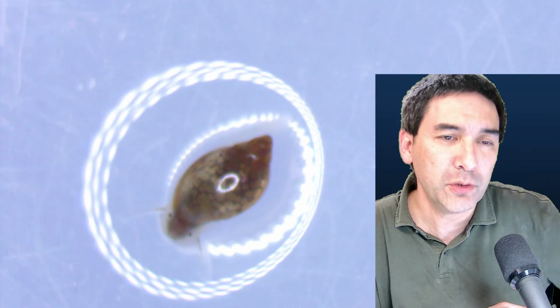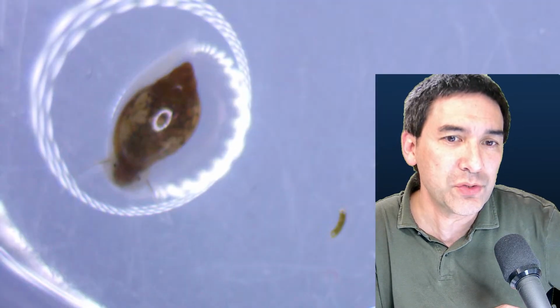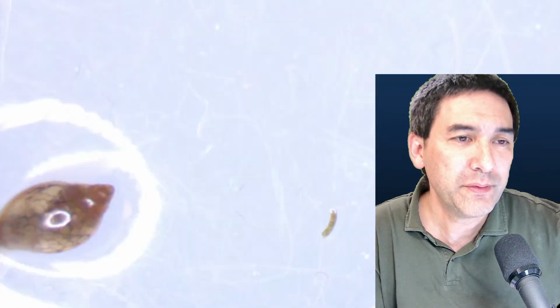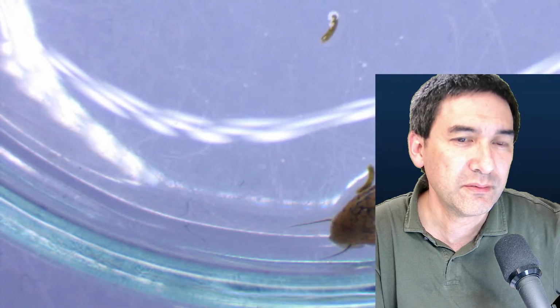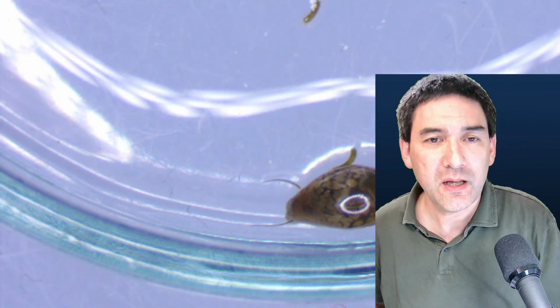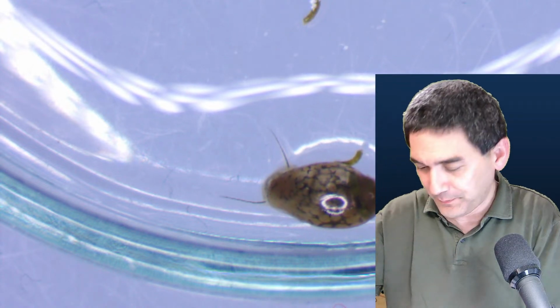So the bottom line is, while we are able to see many things without a microscope, with a microscope things sometimes simply look much more interesting. Okay, you get the idea. So this was essentially the next question. Some of them are also quite advanced.